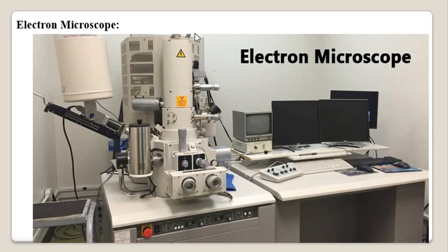Then the magnification system comprises lenses. In a light microscope, magnifying lenses are there, so the objective lens and optical lens are there, whereas in the electron microscope, electromagnetic coils are used as the magnification system. In a light microscope, condenser, objective and ocular lenses are used.